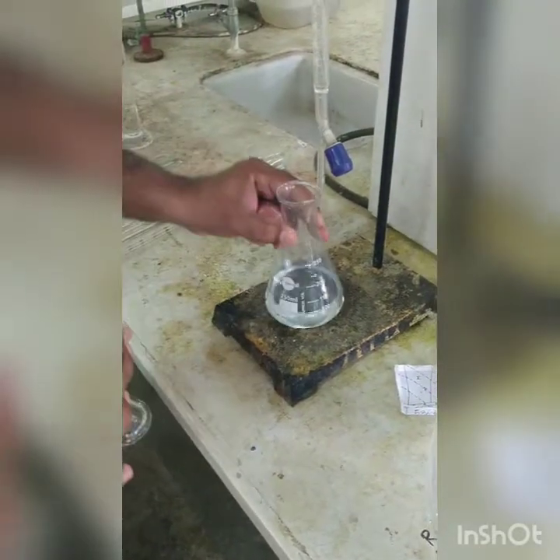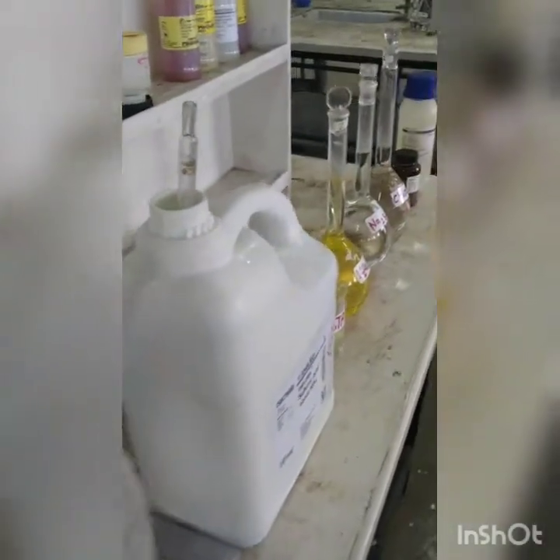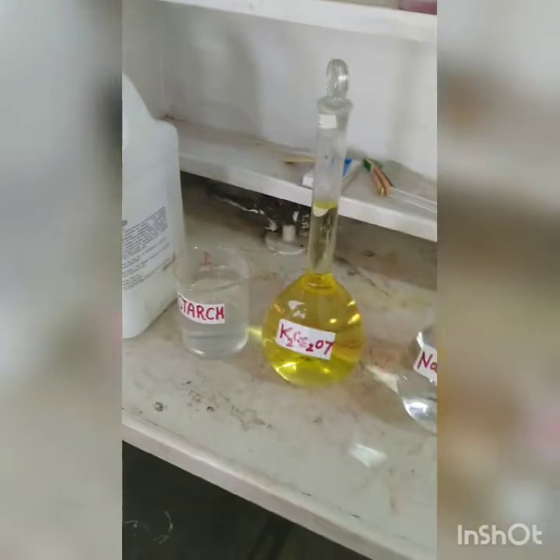Now we are required to add 10 ml of 0.001 normal potassium dichromate. So add 10 ml of 0.001 normal potassium dichromate. So here it is.